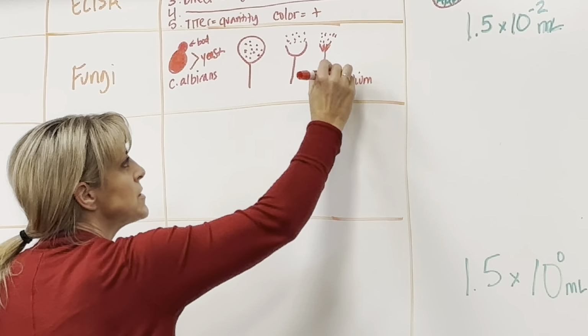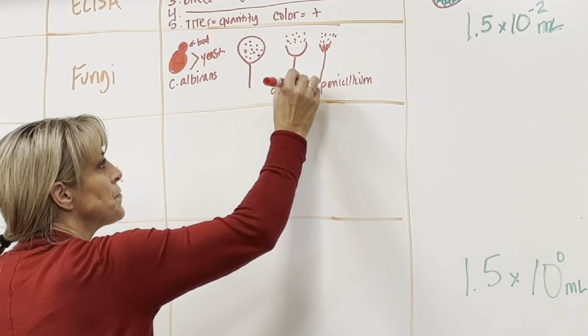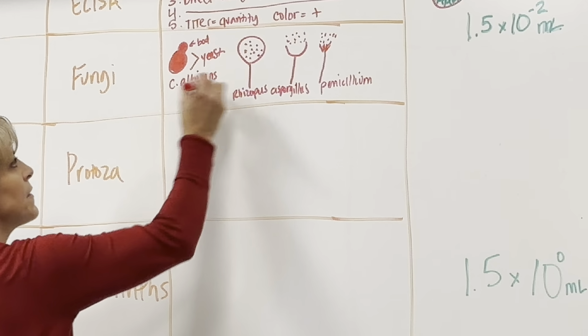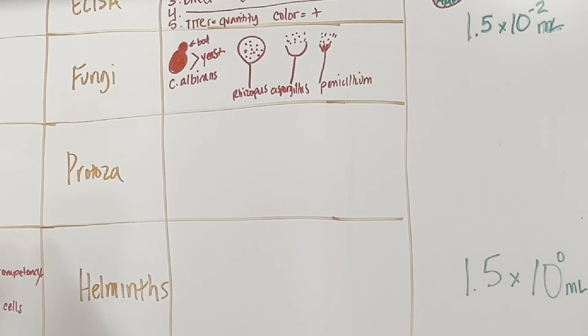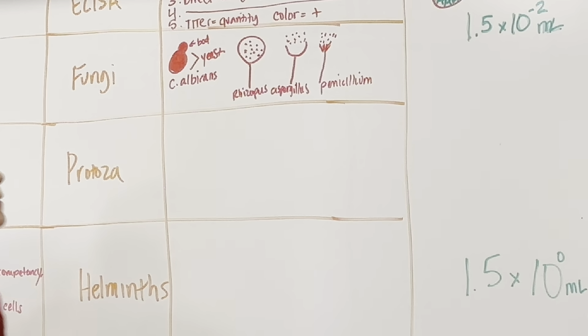We'll look at it downstairs. This is aspergillus. This is rhizopus. You don't have to know that. And that's candida. Candida is our biggest yeast that we worry about, but there's other types of yeasts. We'll just say candida. These have this bigger vesicle. You'll see it in the lab today.